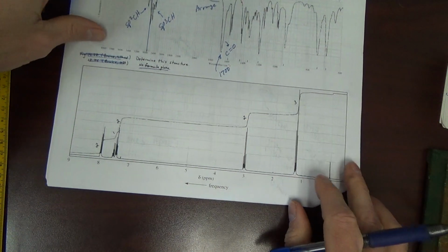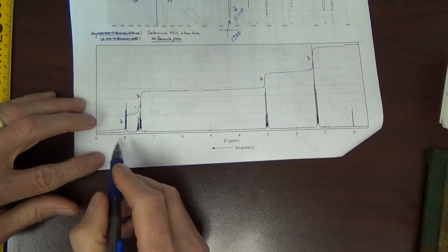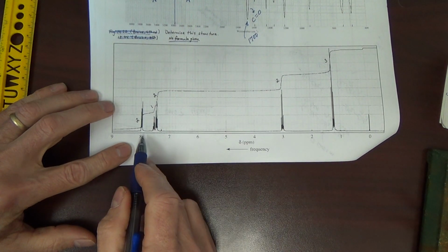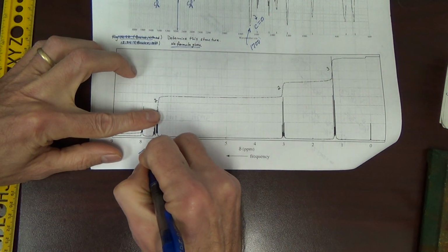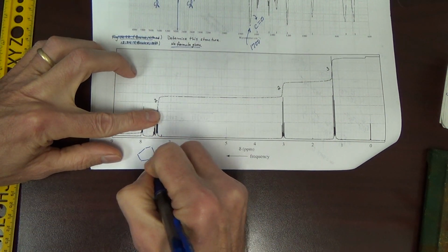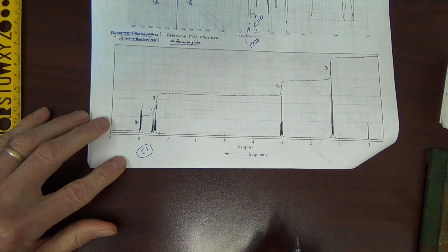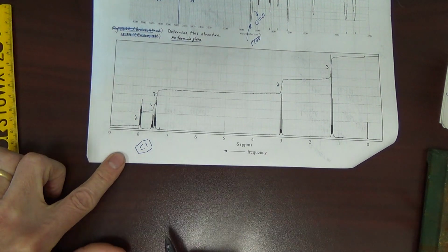Okay. Let's see what we have here. 7 to 8, what type of hydrogens here? Aromatic. Most common aromatic ring. Benzene ring. How many substituents on the benzene ring?